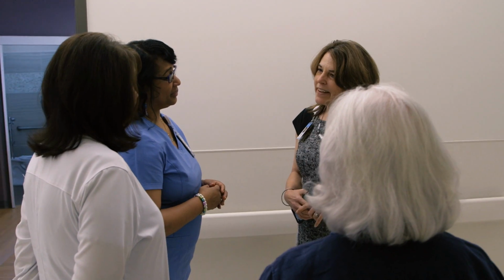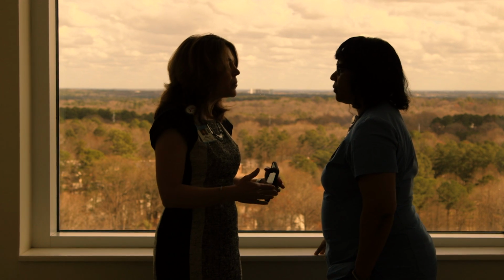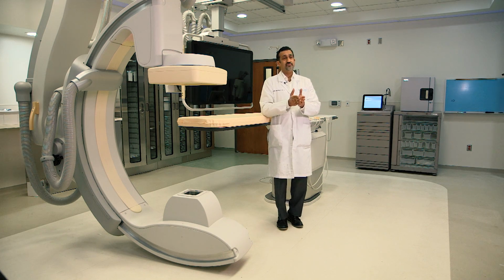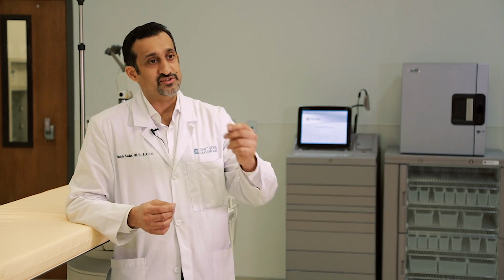units themselves. We're a very highly regulated industry, so there's a lot of paperwork caregivers do that patients probably never know about. One thing that we have to do a lot of monitoring on is the temperatures inside of refrigerators. If a product is needed and it happens that the refrigerator it currently is in has not been monitored, or the monitoring was not accurate, and whatever substance in it has expired, well then that's not available for that patient, and therefore the delay of care. So the risk of that happening has suddenly gone down because we are far more confident that we will be able to get that substance in a way that is usable immediately.